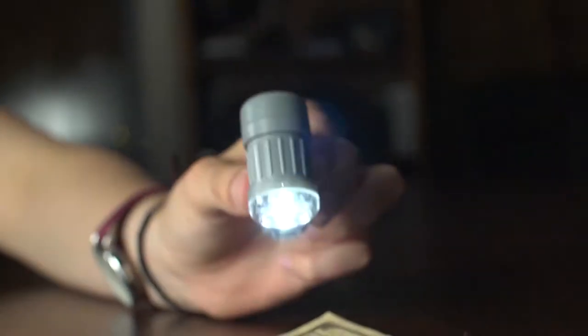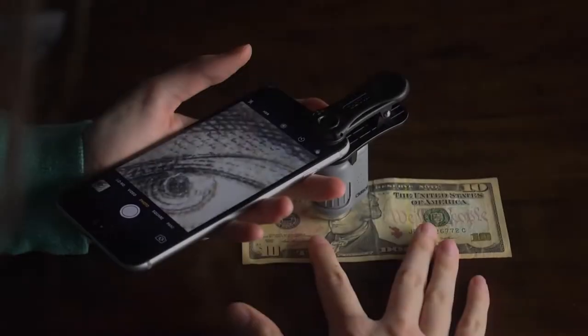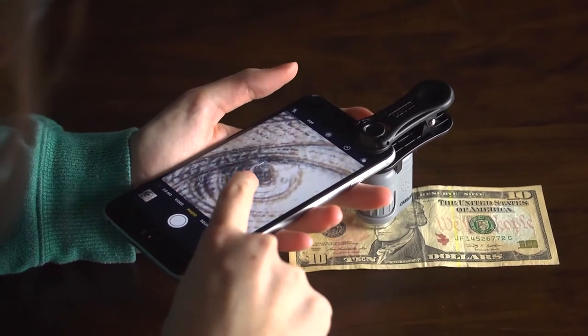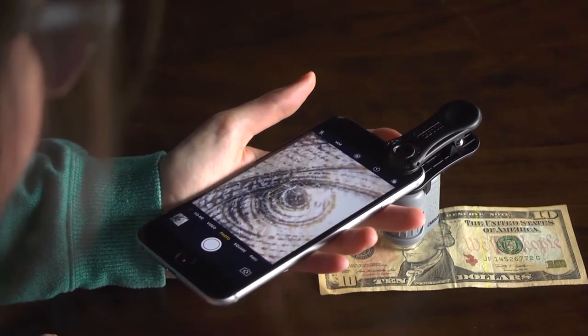When using the micro mini on its own, adjust the built-in focus wheel. When using the smartphone clip, just tap the screen to focus. You can get a nice close-up view on three-dimensional objects as well as flat surfaces.